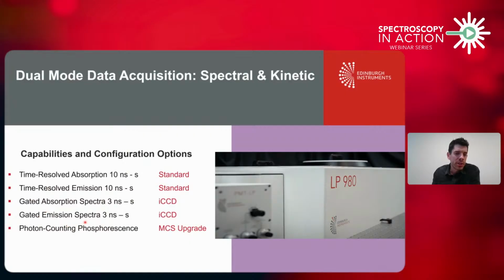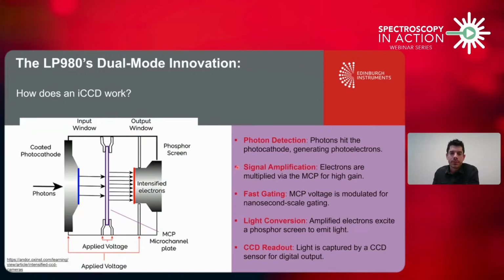Essentially, when I mentioned here about gated emission spectra, I'm talking about laser-induced fluorescence. So the LP980 is also capable of measuring LIF. We will see later on how to do that. In order to move forward, it's worth mentioning how an iCCD camera works in the LP980.